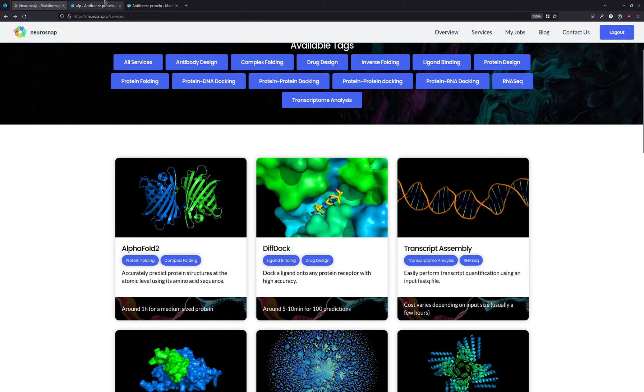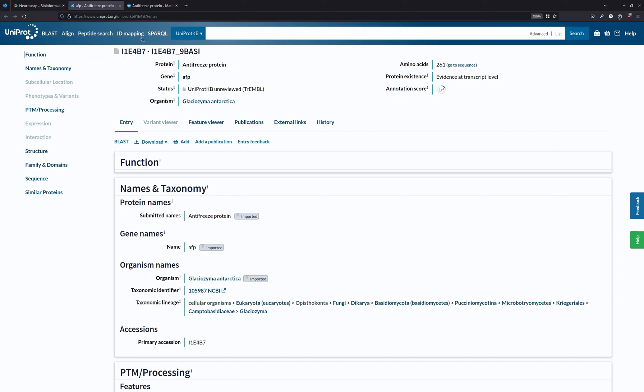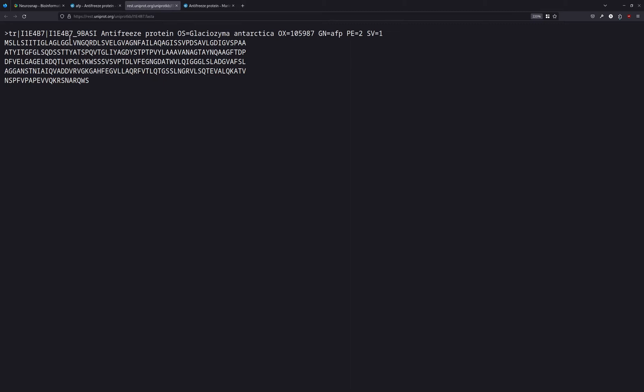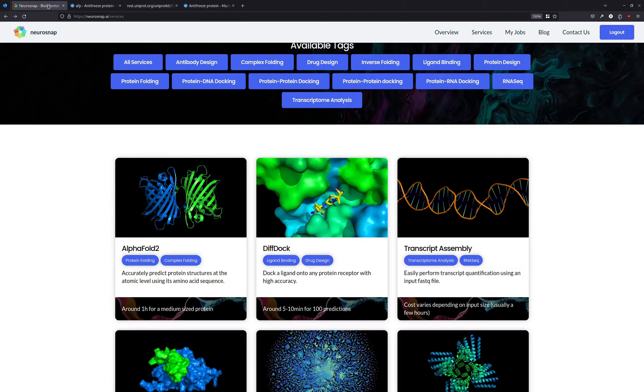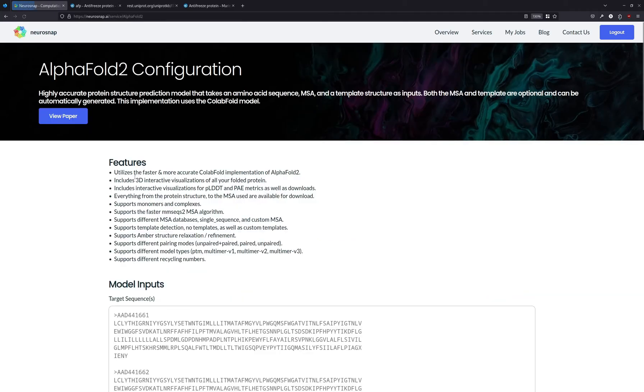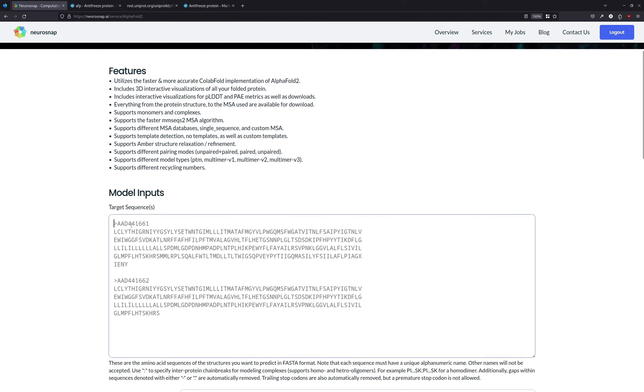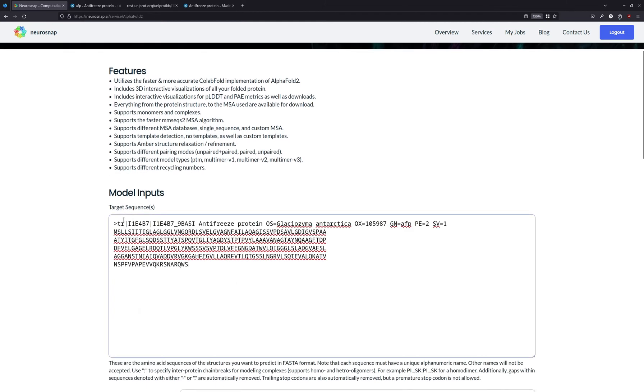So the protein we're going to be folding today is this antifreeze protein from a species of yeast from Antarctica. And essentially what we're going to do is we're going to copy over the amino acid sequence from UniProt, we're going to select the AlphaFold service, and then we're just going to paste it over here.